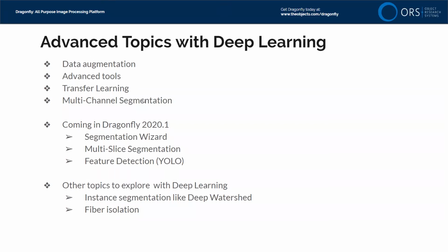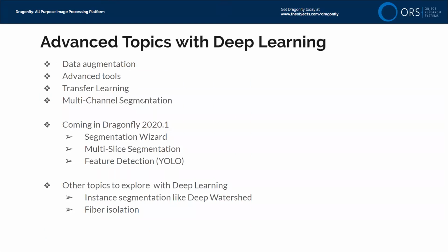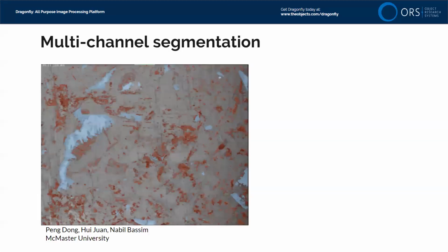Now, I do want to talk a moment about transfer learning. Oh, that's multi-channel segmentation. Okay, we'll talk about multi-channel segmentation. Nicola and I will be giving a lecture in the CCM workshop next week where we'll give an example of this.